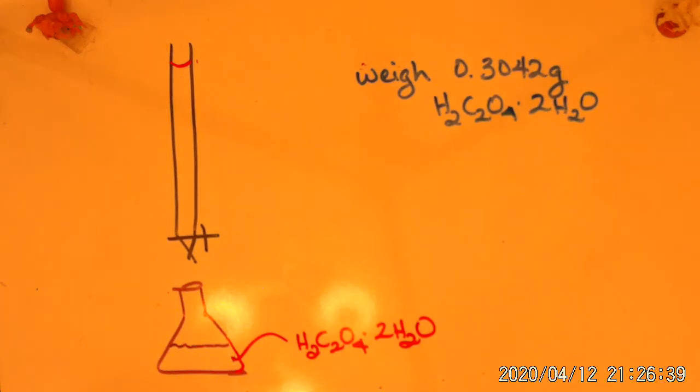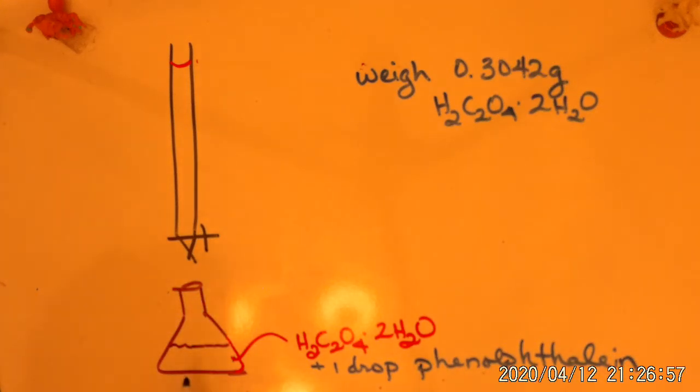Okay? So that's the mass you put in there. You put in your phenolphthalein. This is all dissolved in about 20 milliliters of water.